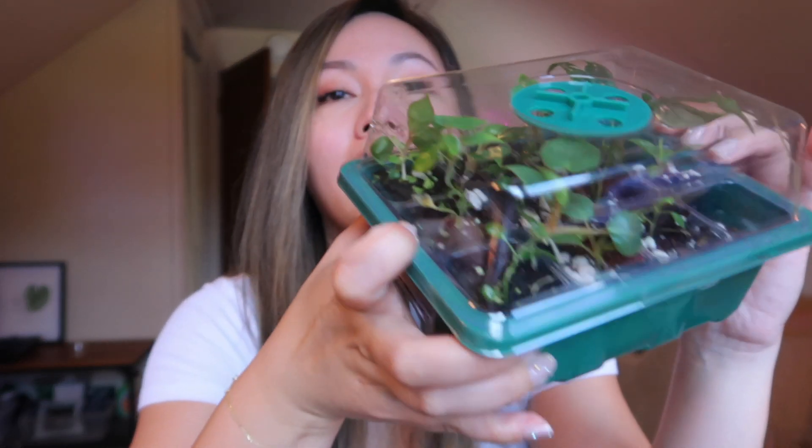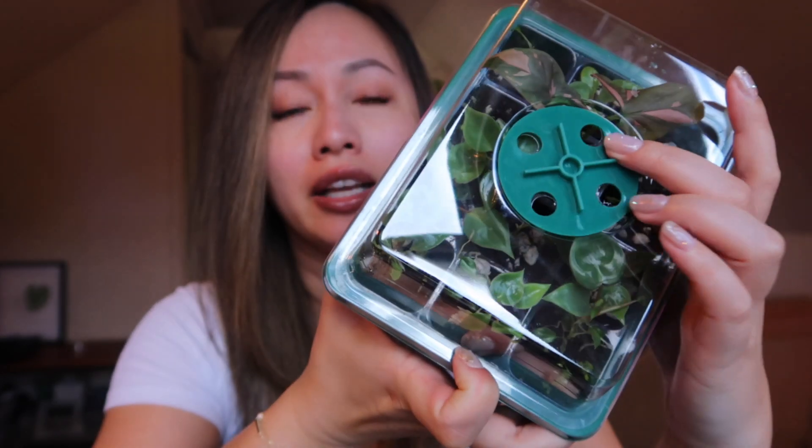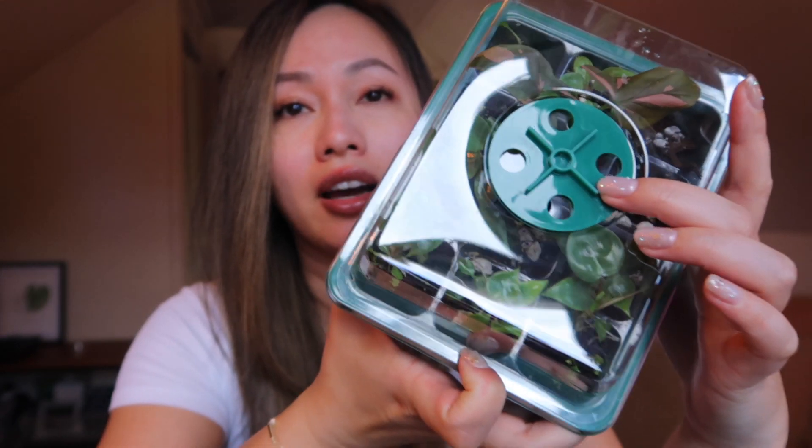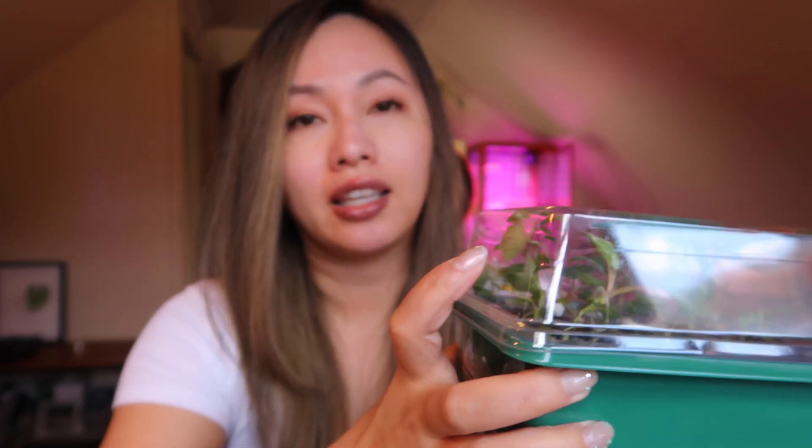Currently, these guys are acclimating down. These holes were previously enclosed, so they were receiving 100% humidity, and now they are fully open. In the next couple of weeks, I'm hoping they acclimate well to lower humidity. That way, I can eventually remove the lid, and next month or so, I can actually pot them up into bigger pots, assuming the roots are going to be okay.